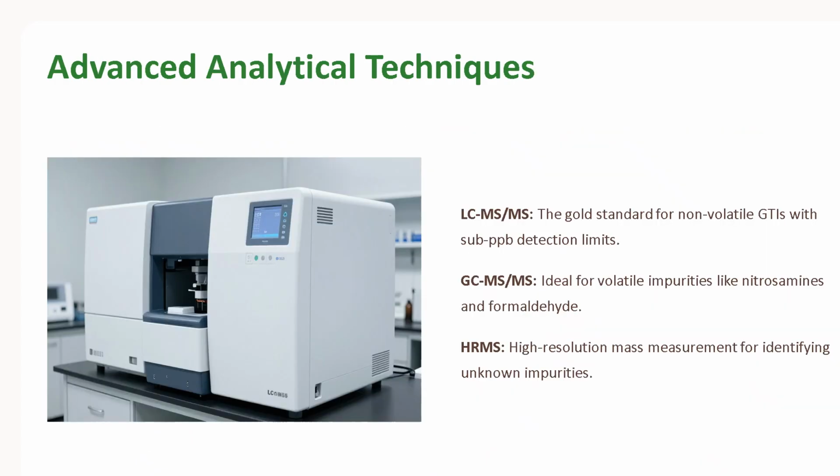Detecting genotoxic impurities is extremely challenging because they exist at trace levels. To achieve the necessary sensitivity, pharmaceutical laboratories rely on advanced analytical technologies. One of the most widely used techniques is LC-MS, which combines liquid chromatography with tandem mass spectrometry to detect non-volatile impurities with extremely high sensitivity.